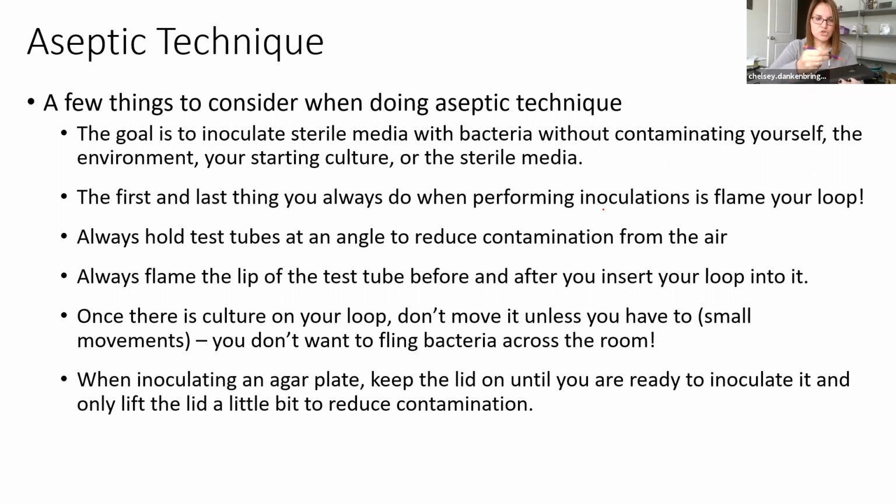contaminants. Then you would just streak the bacteria onto the agar plate, put the lid on it, set it down. And the last thing you need to do is sterilize your loop to eliminate any bacteria that might be on it. And then you can set your loop down and you're done. Okay, so it sounds pretty straightforward, but there's a lot to think about, especially considering there is fire in front of you. So we're gonna do that from the top one more time with a little less commentary from me.